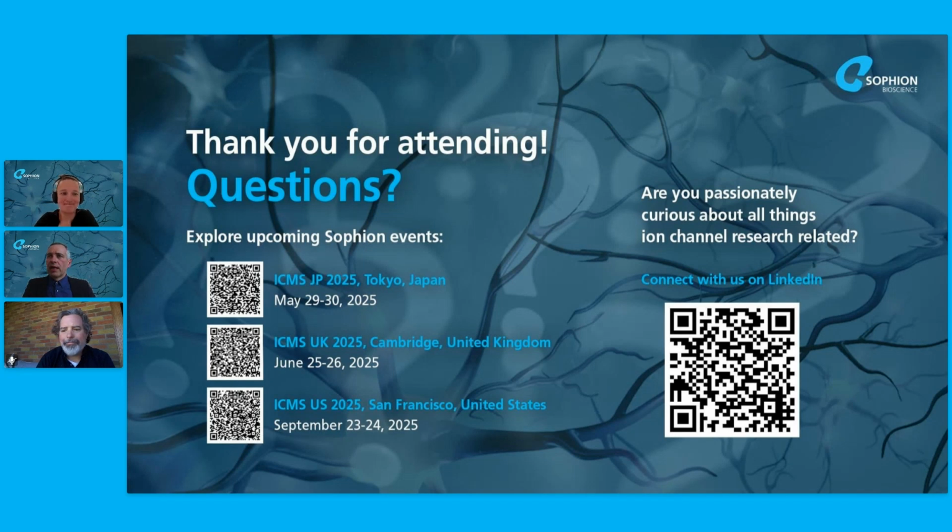And Sumin asks a slightly more involved question. Was the change in firing properties of the granulin disease model controlled for the apparent depolarization, reduction of the minimum voltage trajectory of the action potential? Or in other words, is there some sodium inactivation that is occurring that could explain the difference?